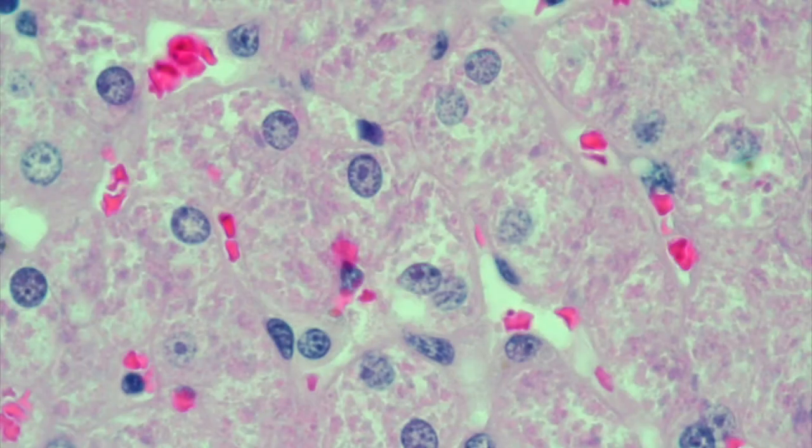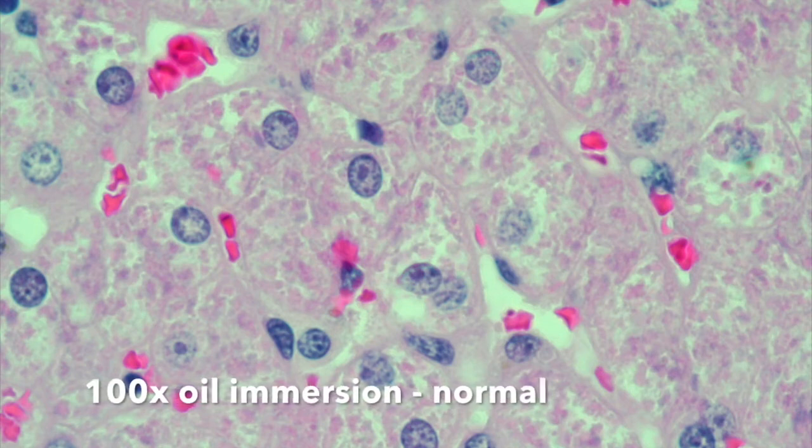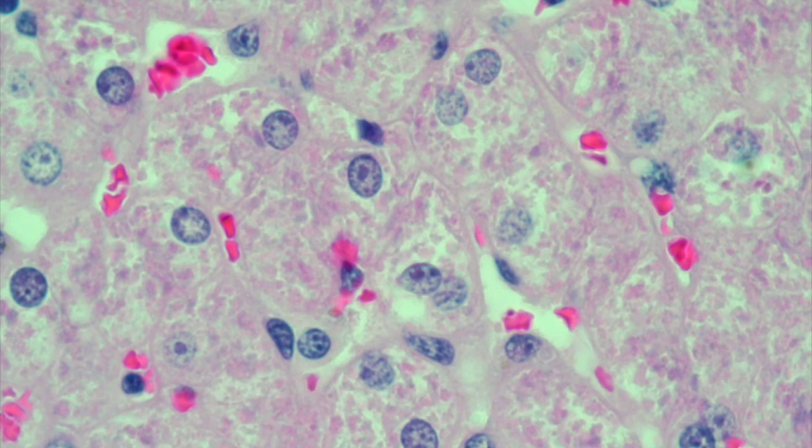Now if we move back to the first slide, which had only the single cover slip, and I've now moved to a 100x oil immersion lens to demonstrate this next issue. So here, the slide that's been cover slipped correctly, we can see some good detail there, and pay particular attention to the morphology of the nuclei, which have been nicely stained with Ehrlich's hematoxylin.